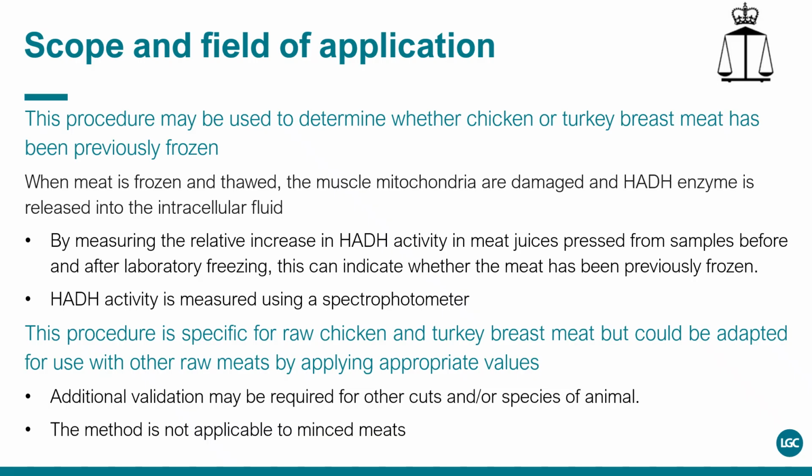The measurement of HADH activity in the intracellular fluid, taken by pressing the meat and analysing the fluid using a spectrophotometer, is a simple, rapid and reliable procedure for a laboratory to undertake when evaluating the reported cryological history of raw chicken or turkey samples.